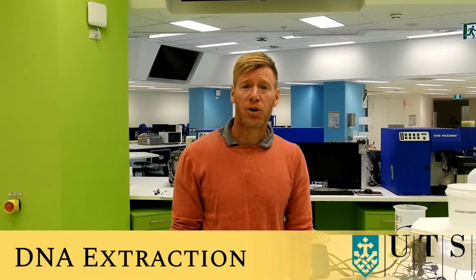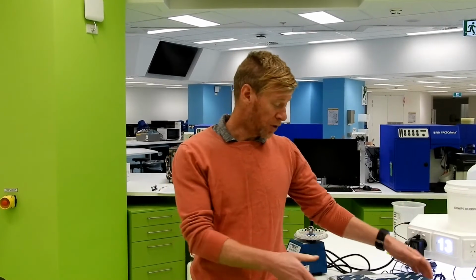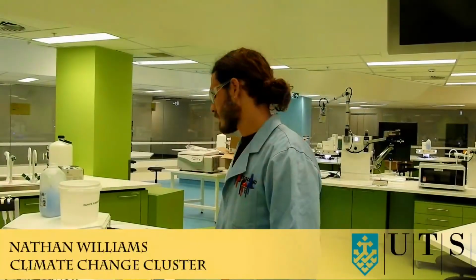In today's video, Nathan's going to show us how to extract microbial DNA from an environmental sample. This will be a sediment sample that we've collected from the Sydney Harbour estuary. DNA extraction is the first important process in any molecular biology approach, and you can do this in many different ways. Today we're going to use a commercial kit, the PowerSoil DNA Extraction Kit.